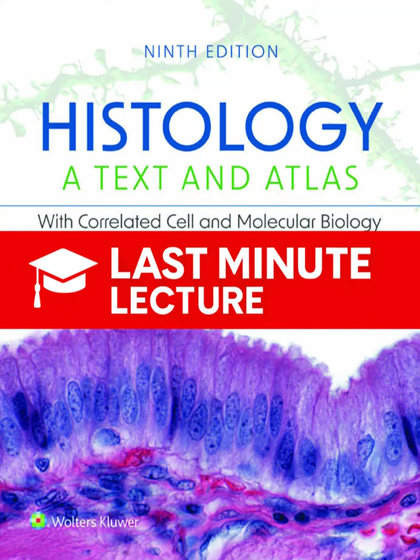And instead of staining the expected blue color, what happens? The color shifts dramatically to red or even purple. And this happens because that high density of negative charges forces the individual dye molecules so close together that they start to clump up, forming these dimeric and polymeric clusters. And those clusters absorb light differently. Exactly. They have totally different light absorption properties than the individual molecules, and that results in the visible color change. It's a really key diagnostic feature for identifying certain kinds of cells and matrices.